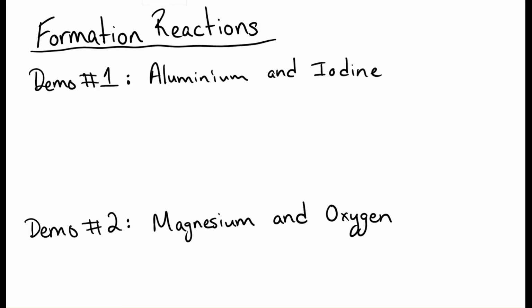That reaction was a pretty cool reaction. Some really deep purple smoke going on, and at a couple points in time we saw some white smoke coming off of it. And I don't know if you saw, after the evaporating dish broke in half because of how much heat was produced, there was a white solid substance left at the end. So let's go ahead and try and figure that out, and let's try and write the chemical reaction.